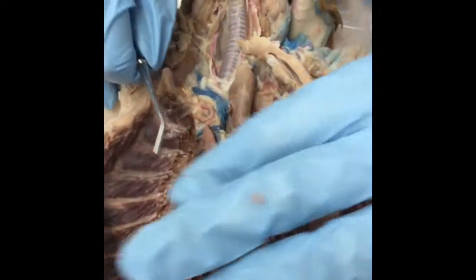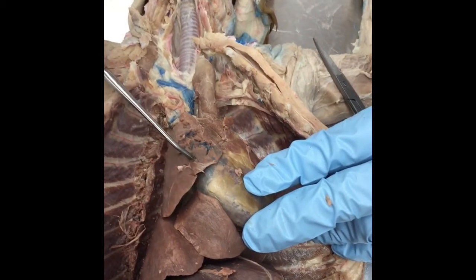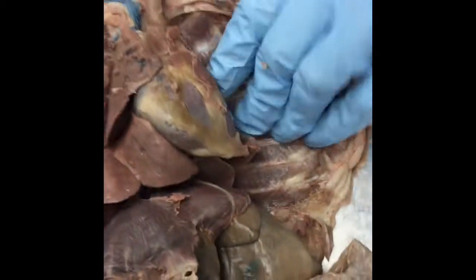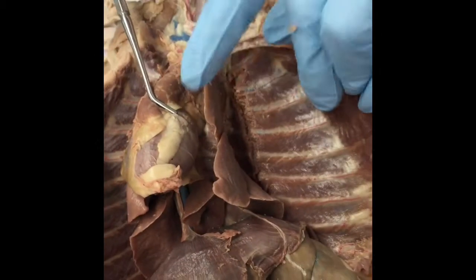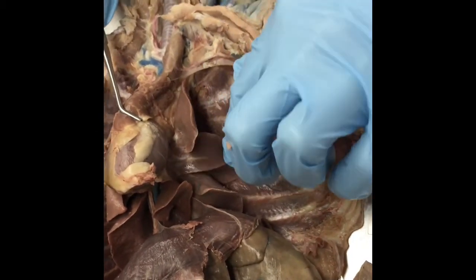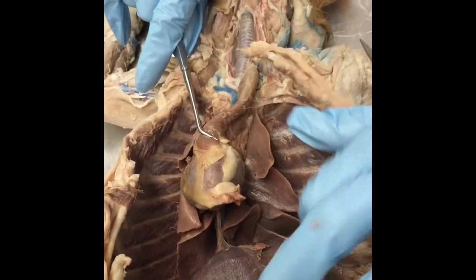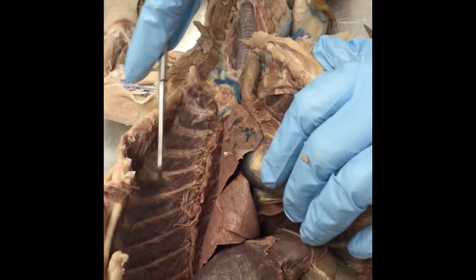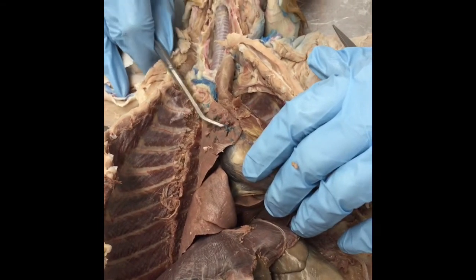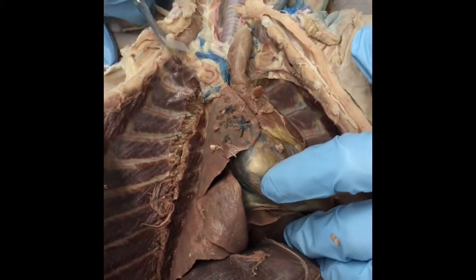And then the lobes of the lungs: the right anterior, right medial, right posterior, and then left anterior, left medial, left posterior. And then the transversus thoracis, and then branching of the bronchi. It's kind of hard to see. I don't even know if that's right. We're good.